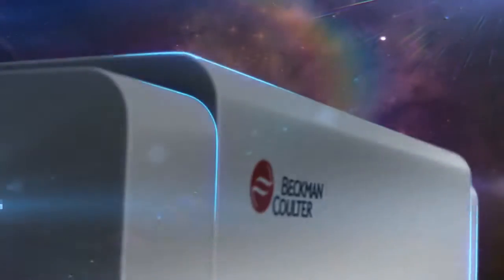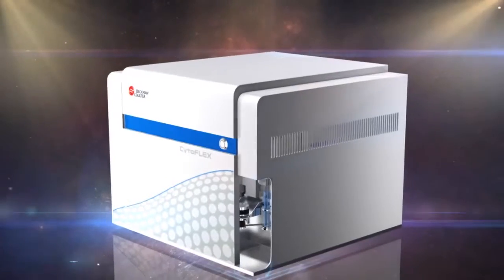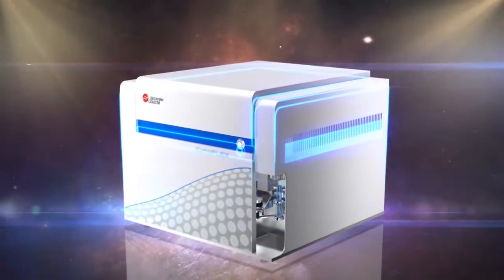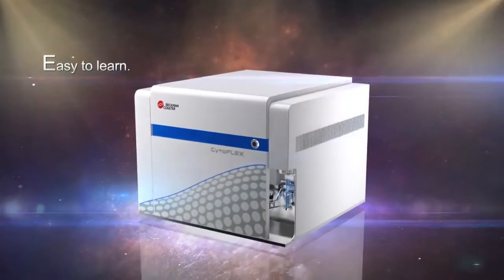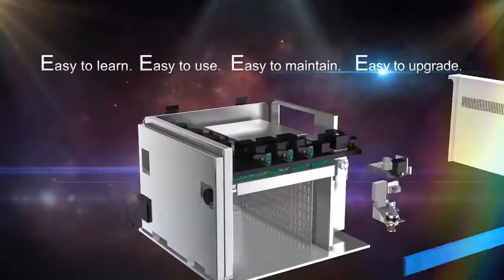No matter how simple or complex your research demands, the CytoFLEX delivers outstanding performance in a compact instrument that's easy to learn, easy to use, easy to maintain, and easy to upgrade.